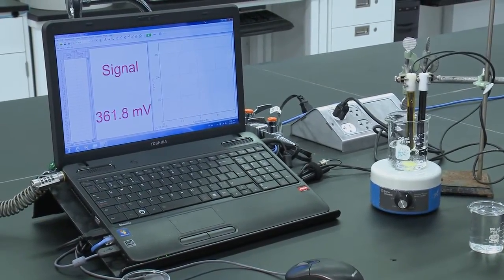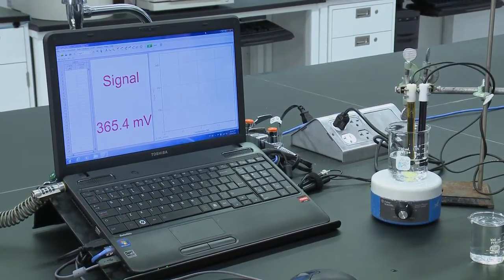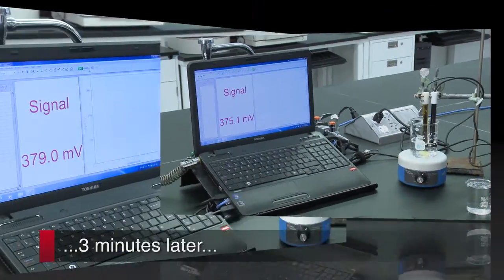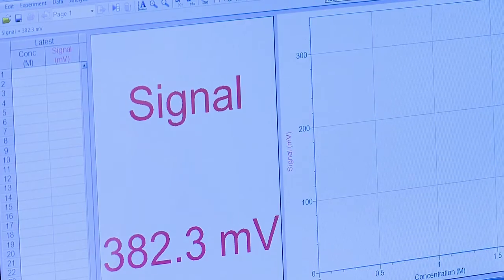At this point, we now have to wait three minutes for the electrodes to saturate. We wait three minutes. At three minutes, you'll want to click the Collect button and then press Keep.